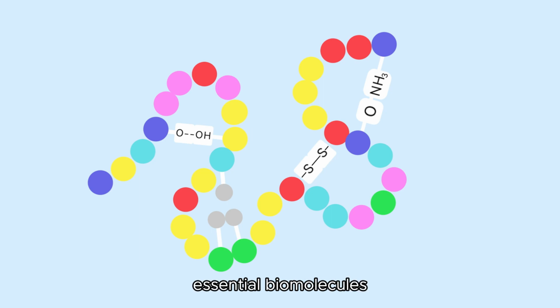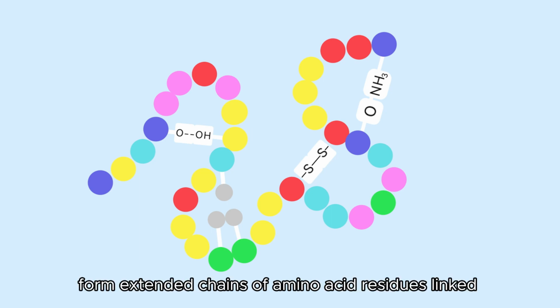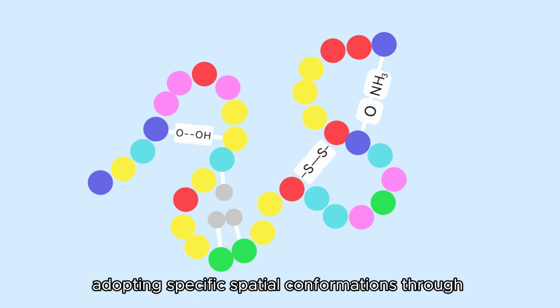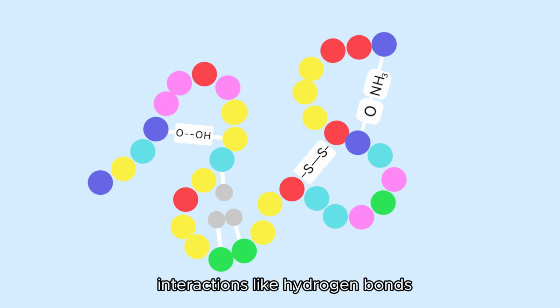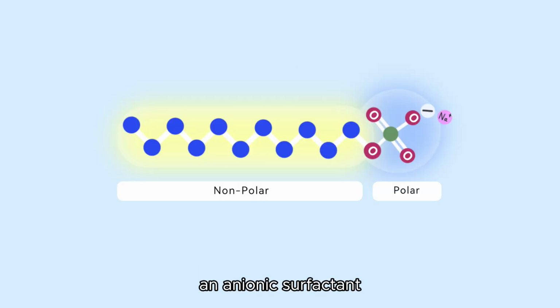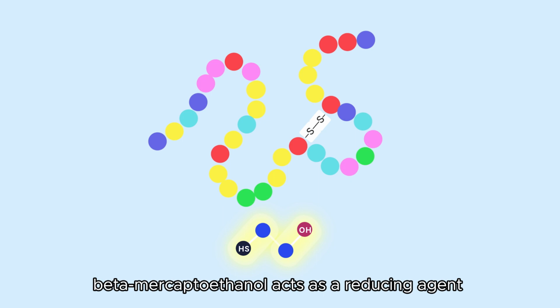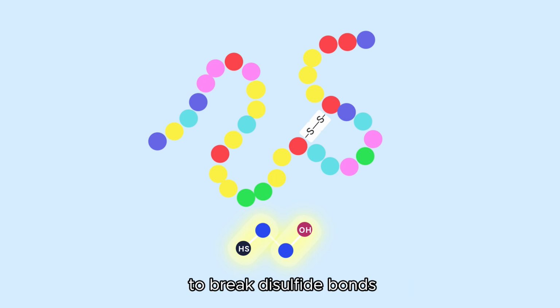Proteins, essential biomolecules, form extended chains of amino acid residues linked by peptide bonds, adopting specific spatial conformations through interactions like hydrogen bonds, hydrophobic interactions, disulfide bonds, and ionic bonds. SDS, an anionic surfactant, denatures native proteins by disrupting non-covalent forces, including hydrogen bonding, hydrophobic interactions, and ionic interactions. Simultaneously, beta-mercaptoethanol acts as a reducing agent to break disulfide bonds.